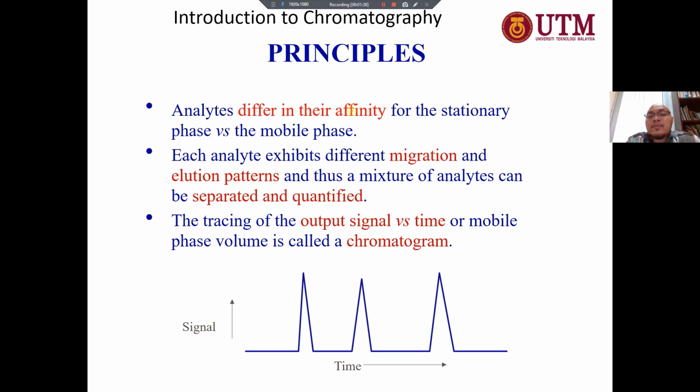The difference in their affinity can be affected by, in gas chromatography, the boiling point. For GC, gas chromatography. But for liquid chromatography, it doesn't involve the boiling point.